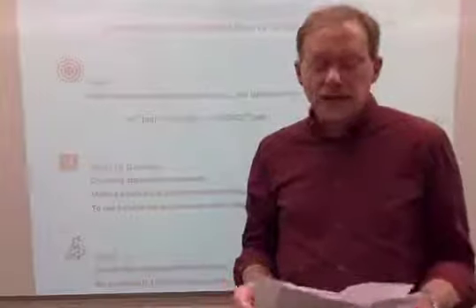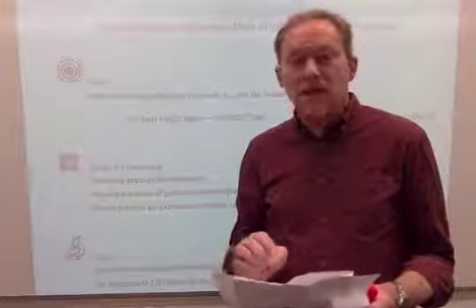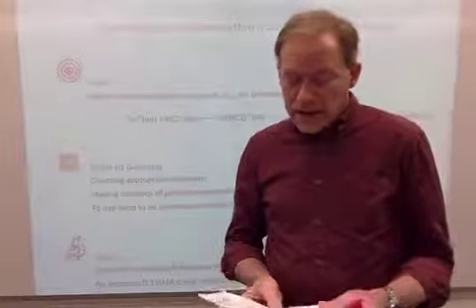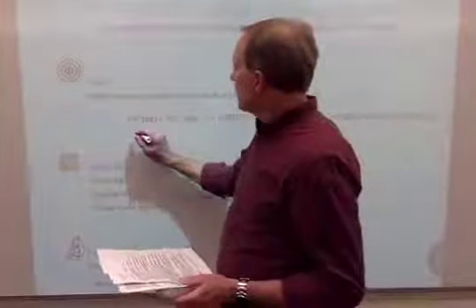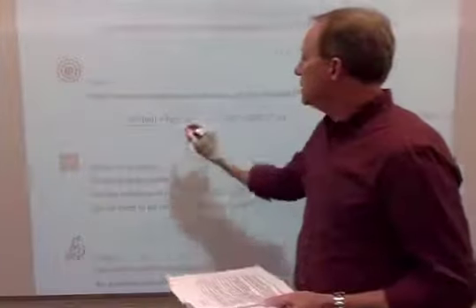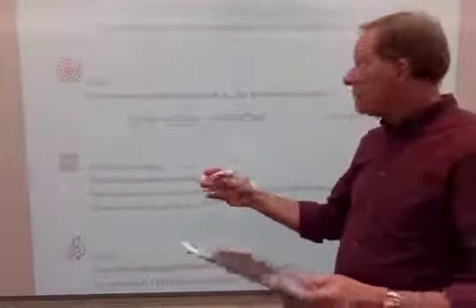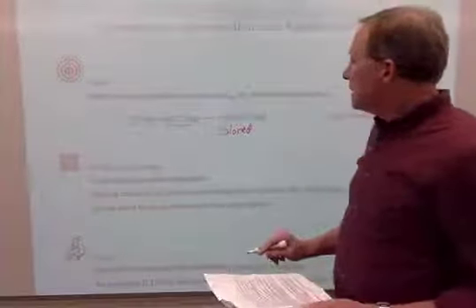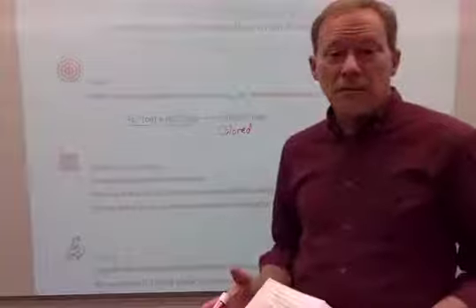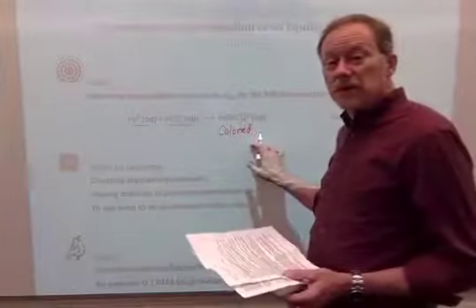And it allows us to observe one of the chemical species by absorbance because it's a colored compound in water. And the other species are colorless. So we're going to control the amount of iron 3 ion and thiocyanate ion that we put in a mixture. And that's going to form this colored compound, the iron thiocyanate complex.